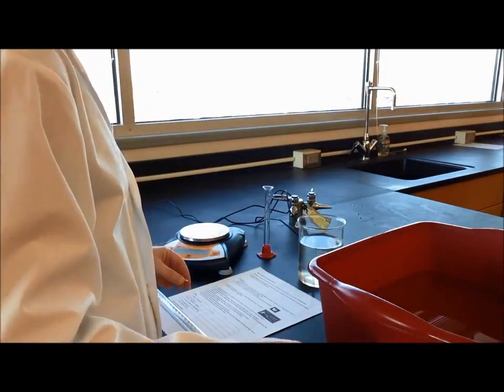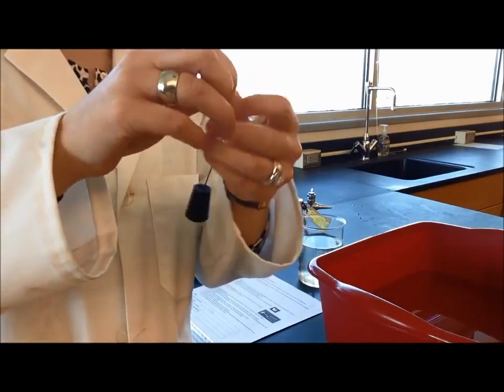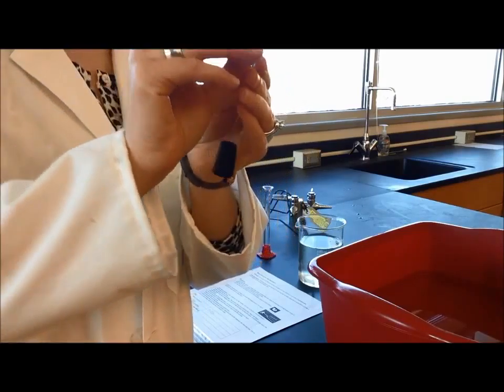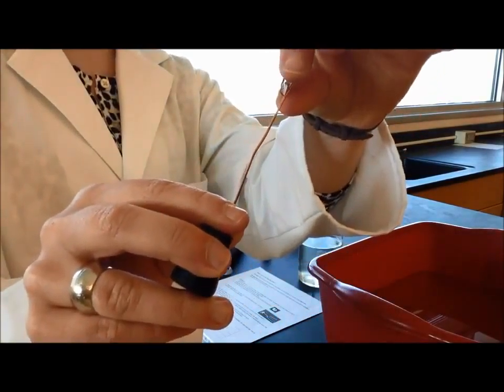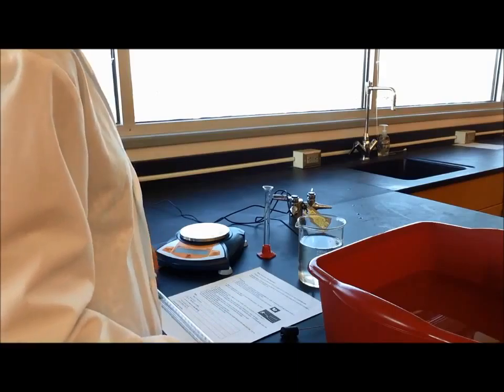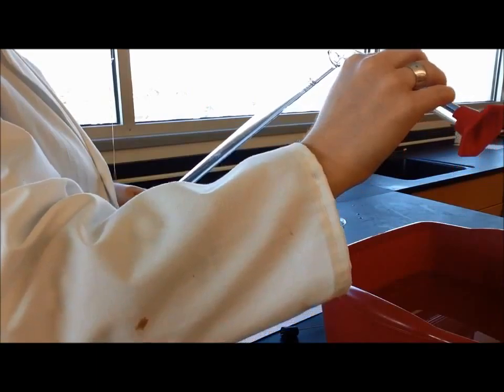Step four says wrap the magnesium in a cage of copper wire. You don't want your magnesium to float away, so I'm going to use my stopper with the copper wire and wrap these two around each other. When we do the reaction, we don't want the magnesium to drift away because it makes the reaction take longer. Step five says pour approximately 10 milliliters of 6 molar hydrochloric acid into the burette — first making sure the valve at the end is closed — then carefully adding it to the burette.